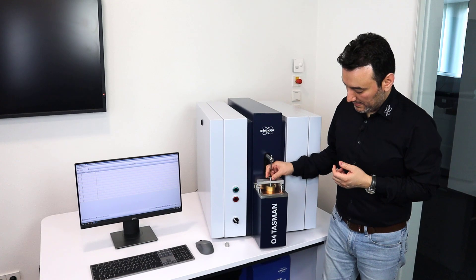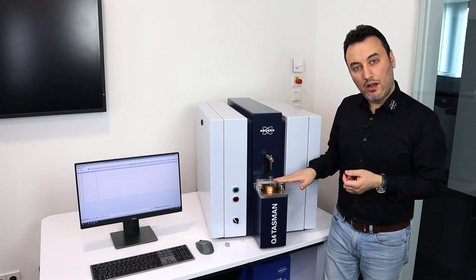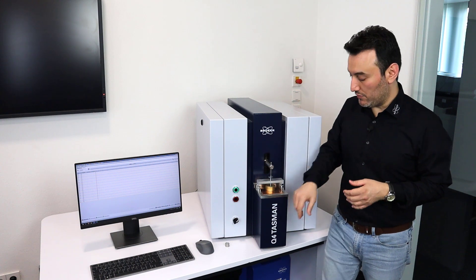I just tighten my screws to apply some more pressure on the sample. Then I lower my clamp. And as you can see here, my system is ready to analyze.